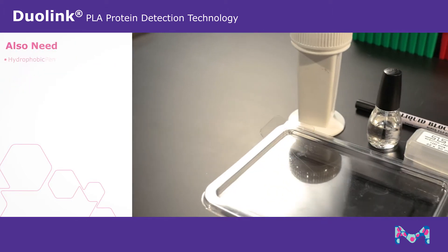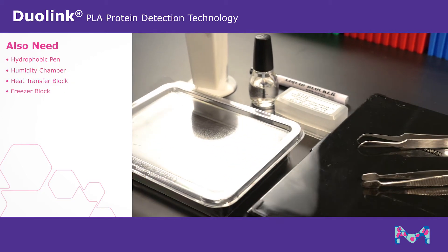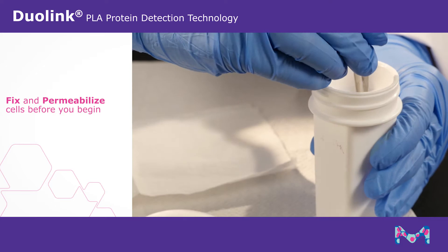You will also need a hydrophobic pen, humidity chamber, heat transfer block, freezer block, staining jar, and a shaker. Your sample must first be fixed and permeabilized on the slide before you can begin.